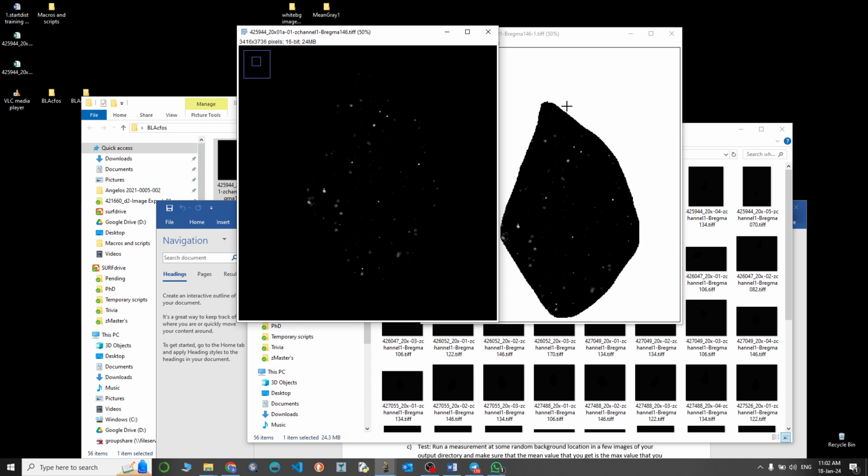And why is this important? Well, one of the reasons is that we're doing it in order to obtain the measurements that we want for the mean gray value, because it kind of helps us create a mask and isolate the region that we want. There are other reasons too, but let's not delve into that.